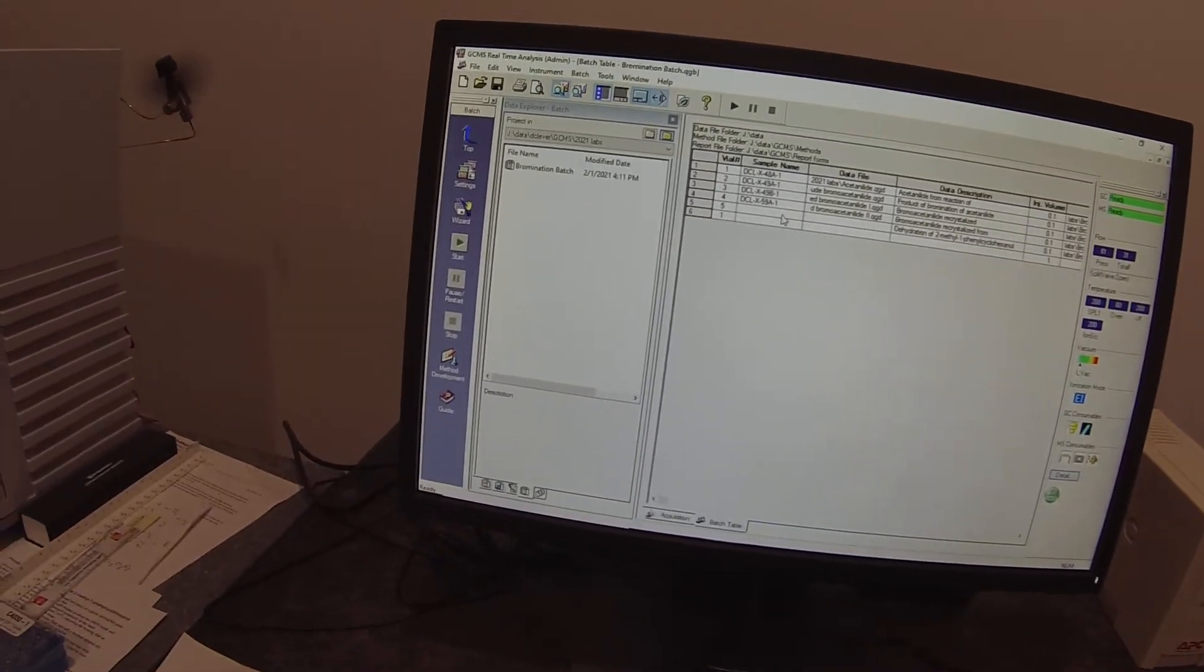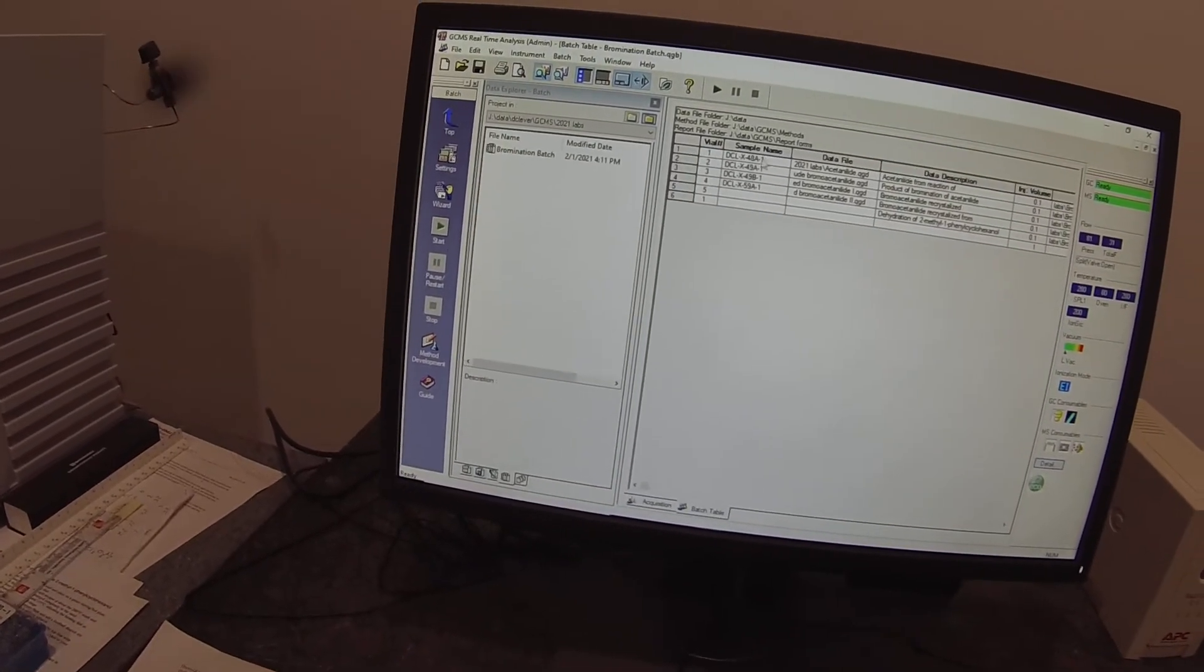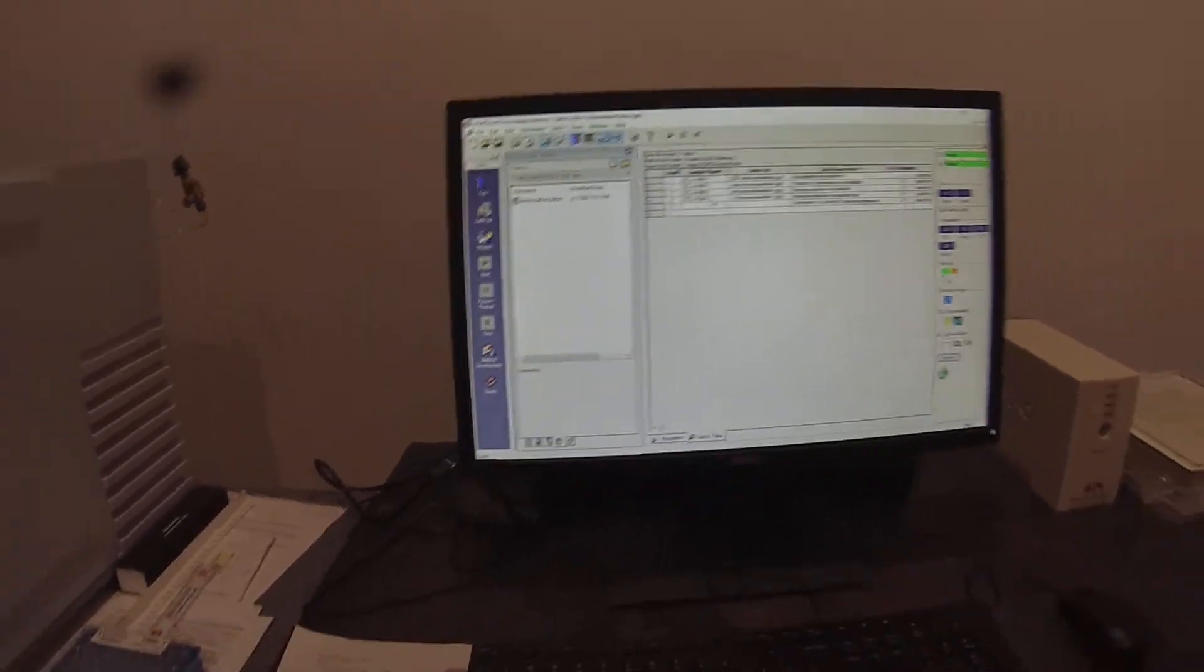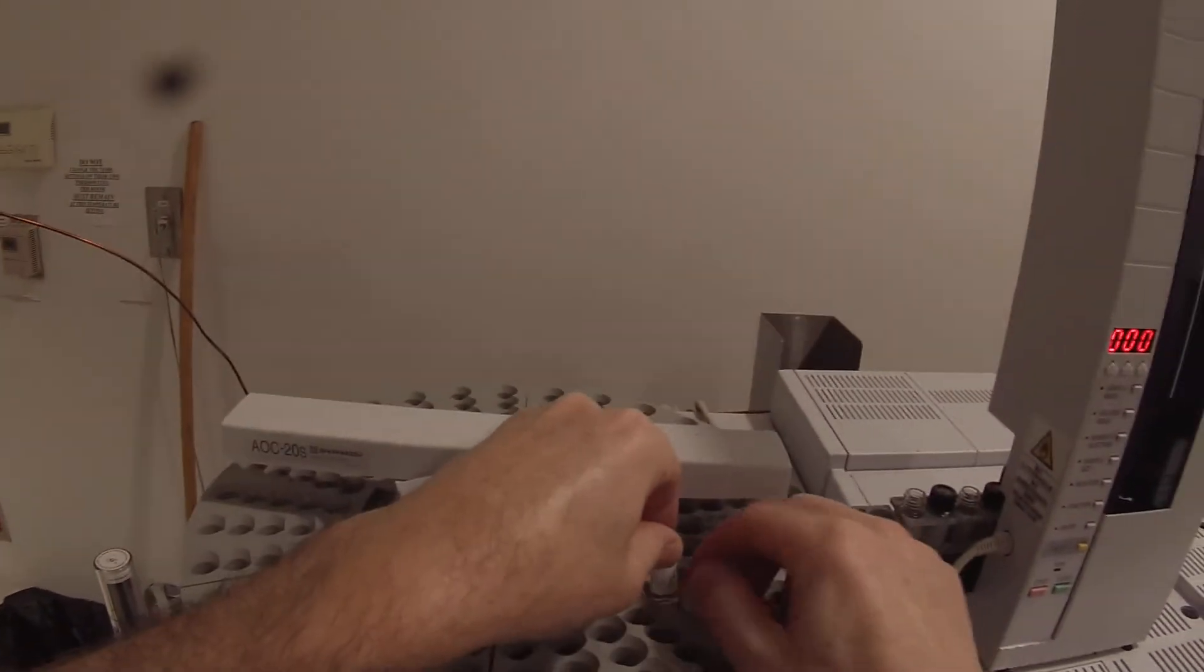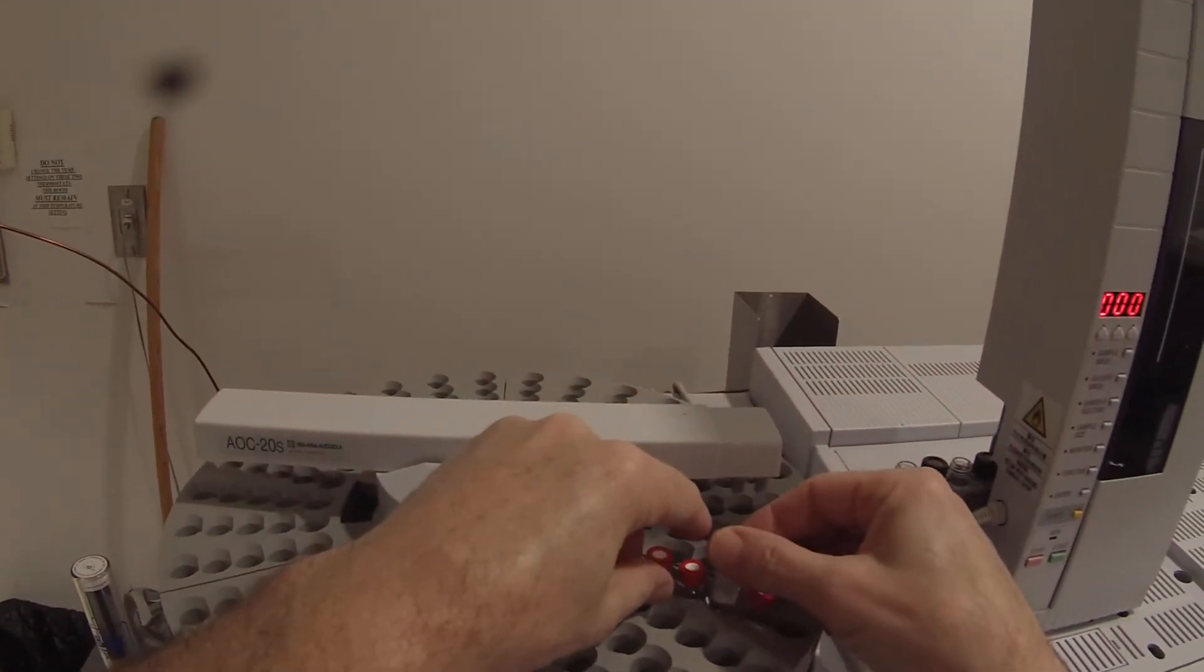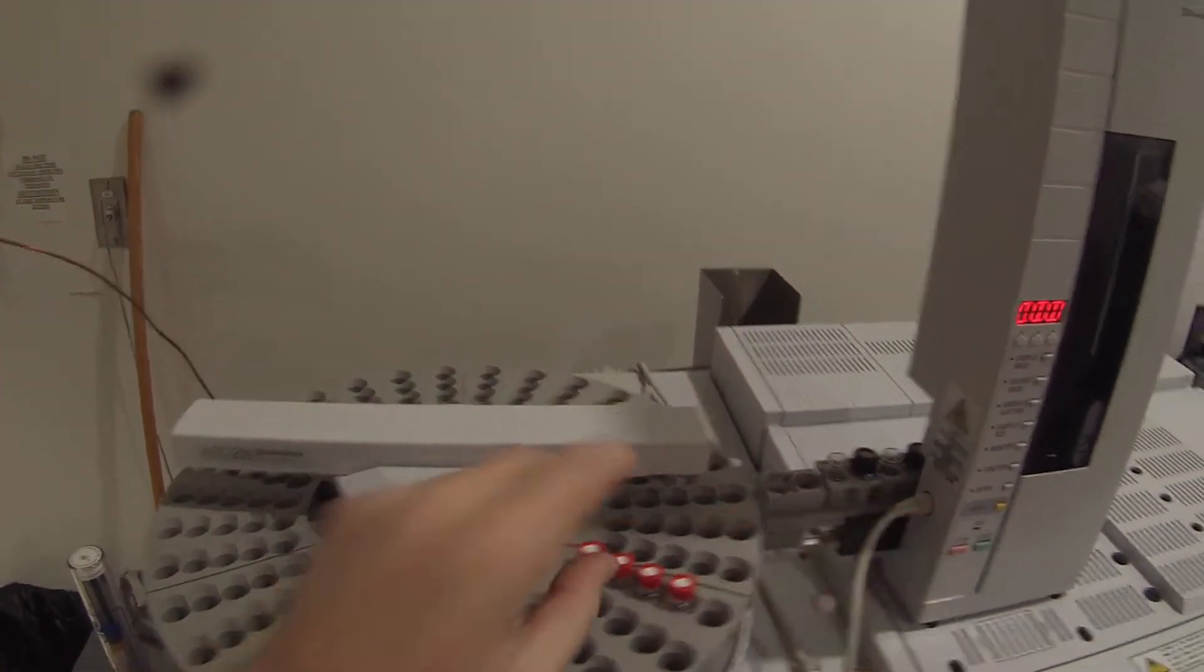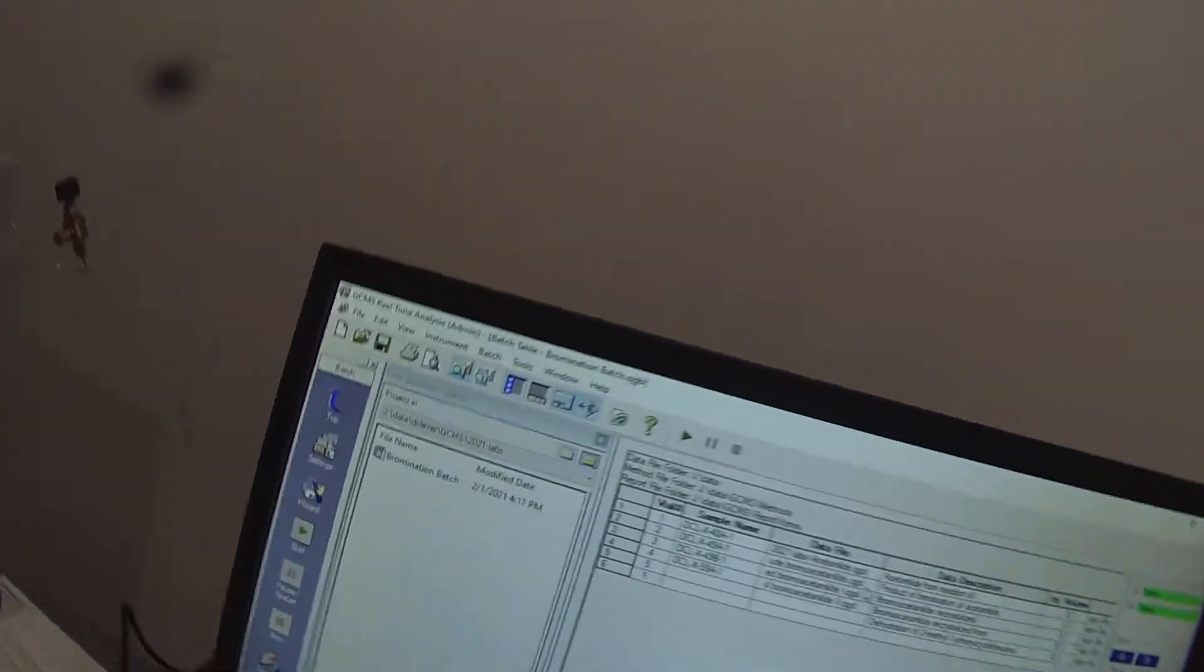So I'm just making sure that I have my vial numbers correct. 48A 49A 49B and 59A. I'll double check and make sure those are where I actually put them. 48A 49A 49B and 59A.